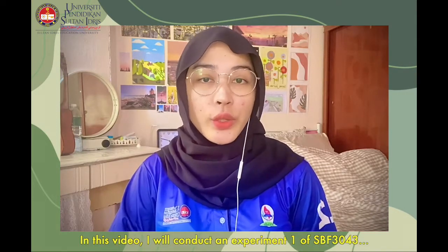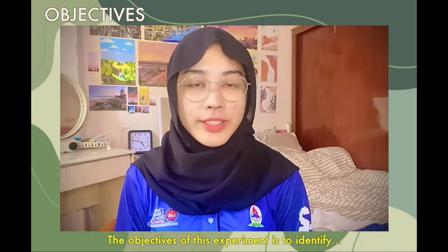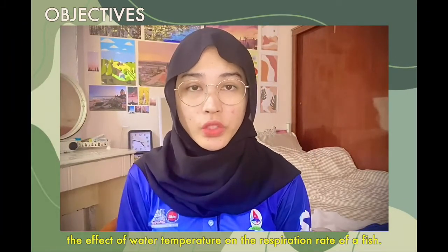In this video, we will conduct experiment 1 of Animal and Plant Physiology, which is respiration. The objective of this experiment is to identify the effect of water temperature on the respiration rate of a fish.